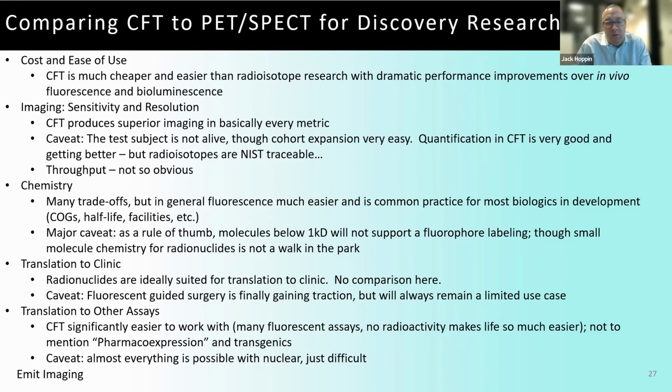I will say too, moving from the Xerra system to a microscope, those trained in the art can get tissue and study it under a microscope. But in my observation, it's far better to have a separate cohort or group that you're going to study under the microscope, as I alluded to earlier.